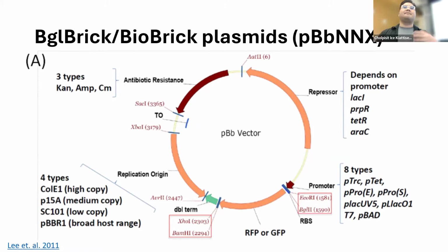And with these different mechanisms and plasmids out there, you can actually make a toolbox. So I'm going to talk about two main toolboxes that we've been using in the lab and maybe in the world as well, because when you have a systematic system that you can segregate or organize these tools, it's going to be a lot easier. One thing that came up during the emergence of the field of synthetic biology is called the BioBrick systems, where they have BioBrick compatible parts right here.